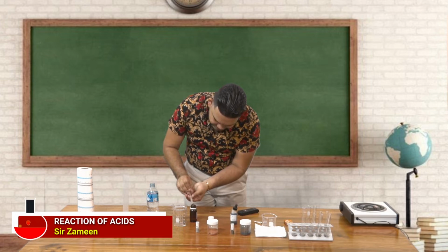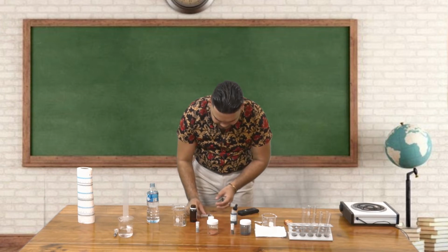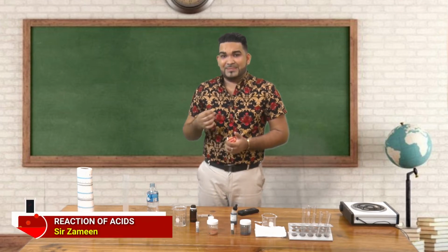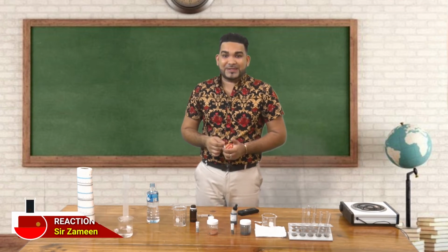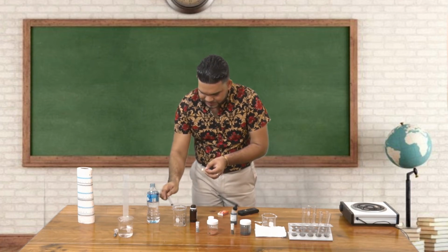And this would be so much fun with you having a lab partner with you. So you and your lab partner can cautiously perform this experiment. I will simultaneously be doing it since I don't have a lab partner here with me today. I will light my match before I drop my sulfuric acid into the magnesium. Alright, so let's see what will happen. Pay attention.